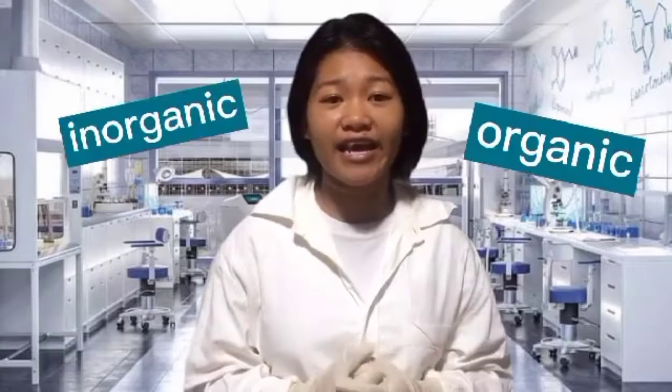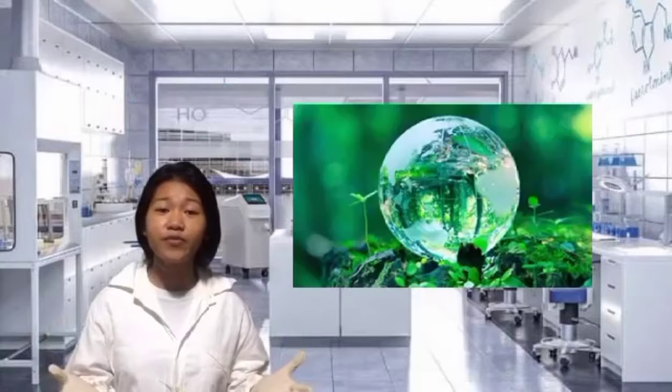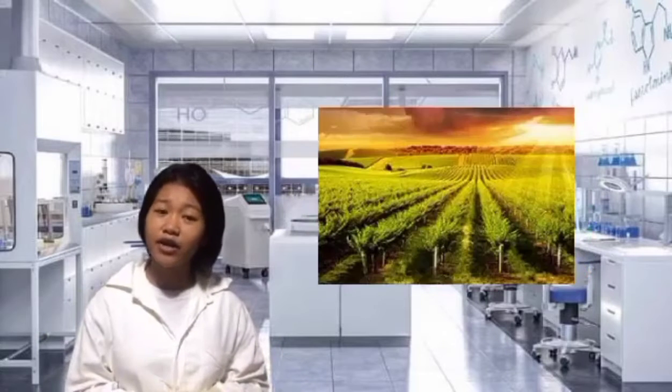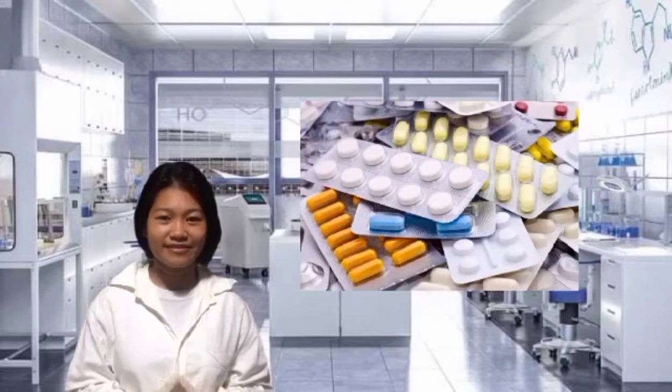Potentiometry-based analysis methods are highly important in the field of electrochemistry. It is commonly used for the determination of different organic and inorganic ions in various areas such as process control and environmental, industrial, agricultural analysis, and also medicinal drug analysis.